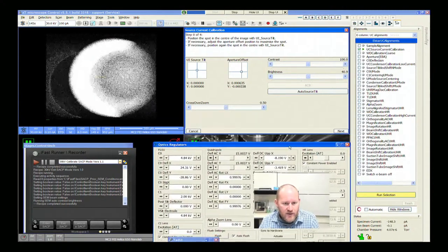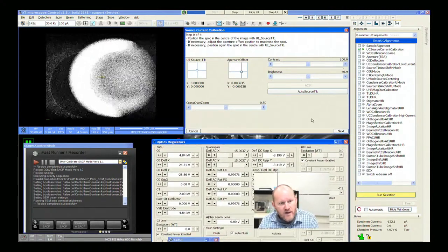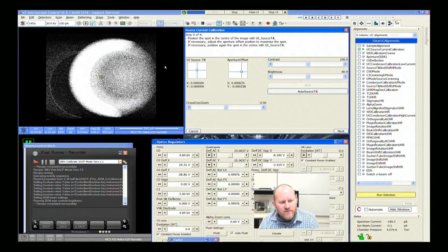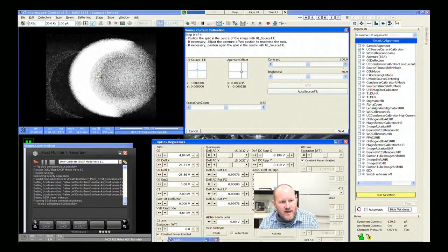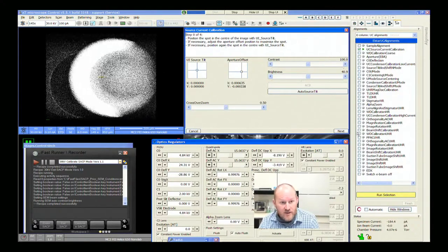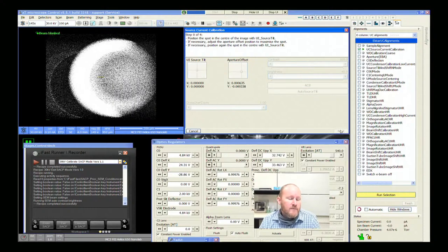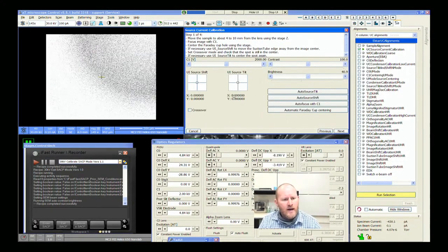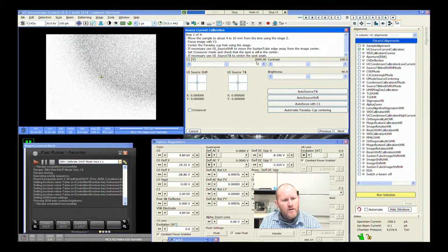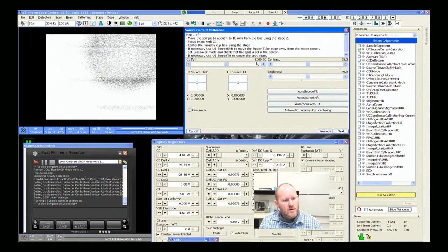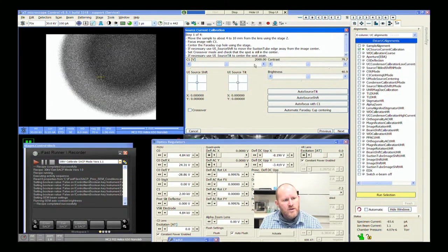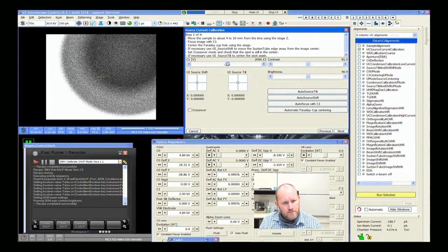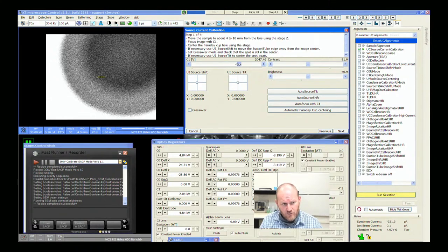That's why I like using this. We're not going to use it in the standard mode though — I ignore this first page; it's just asking if you can see something. So I'm going to go to the next page. First, we're going to use C1 to focus and just get it roughly in focus. What you're looking at now — this medium gray area is the backside of the backscatter detector. To find the appropriate C1 value you don't need to be in CBS mode — CBS is only for actual collection of the patterns. So let's retract that and go back to ETD.